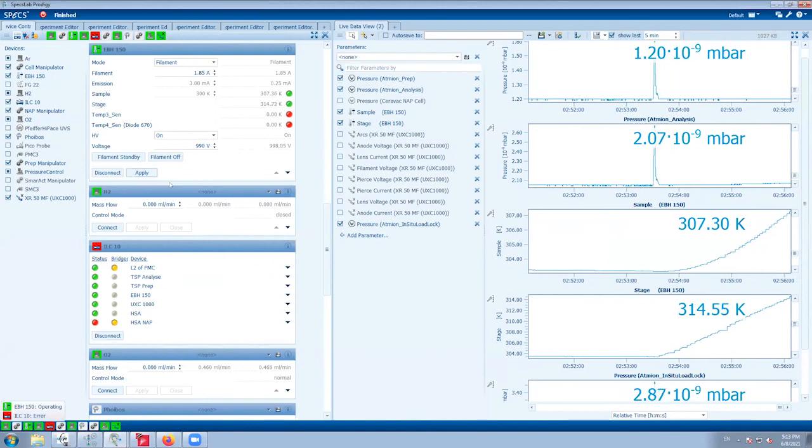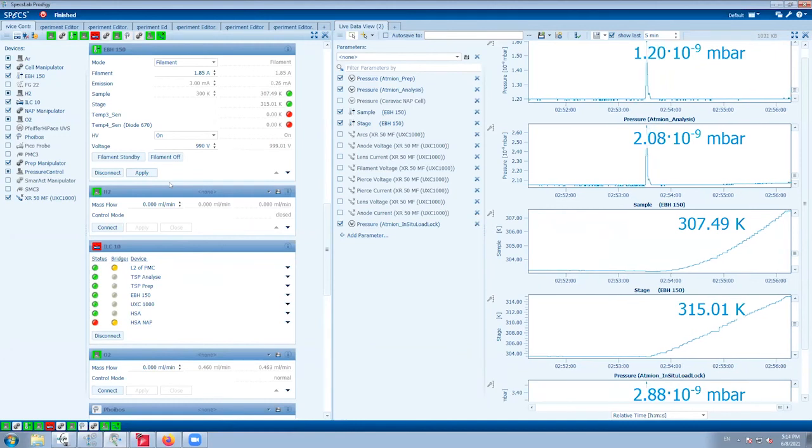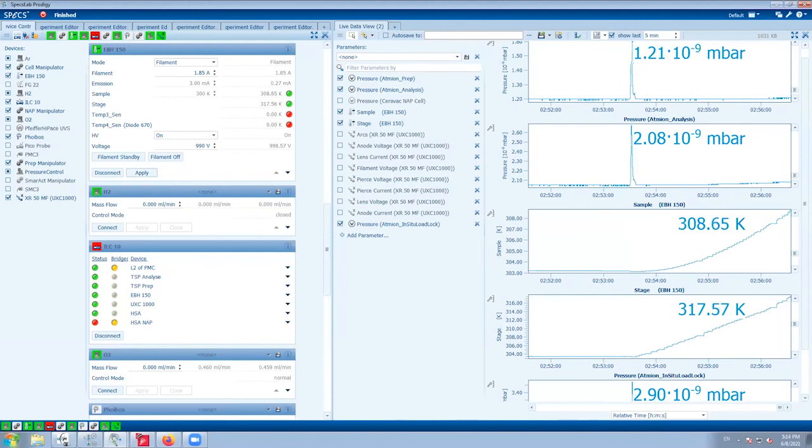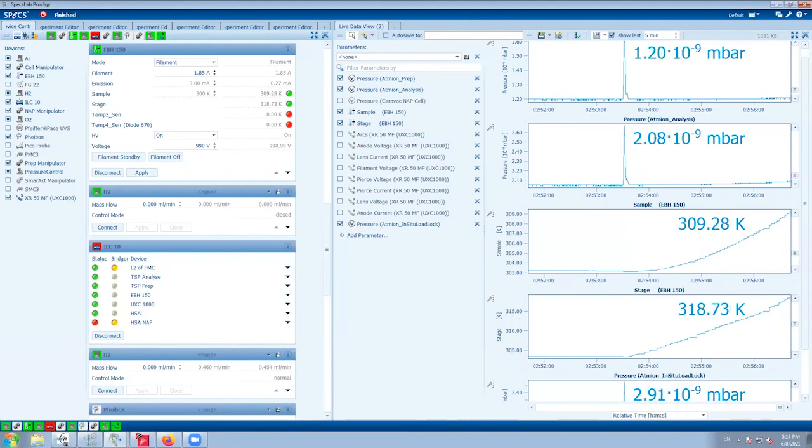So even though we will probably not have time to analyze the data, we kind of touch on the fitting procedures. And of course, this is mainly based on experience. The more spectra you fit, the more of an expert you become. Every system is a little bit different, and you need to study the literature on that particular sample or material, to compare already published data and get your own idea of what you actually have.